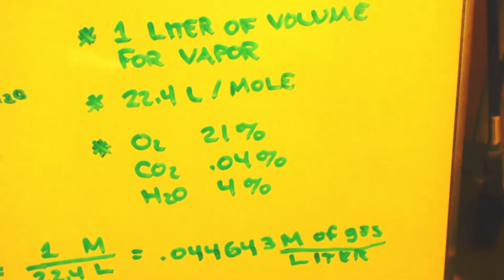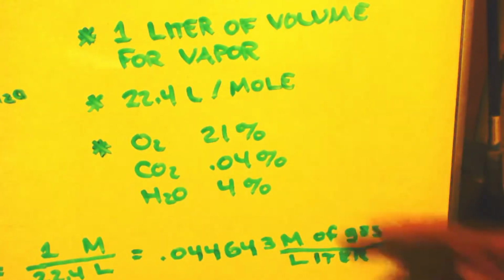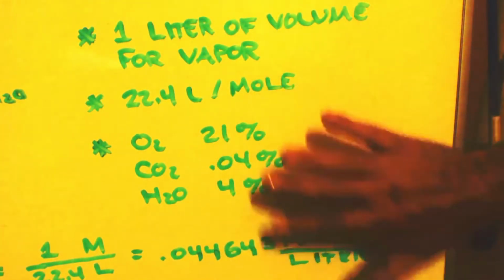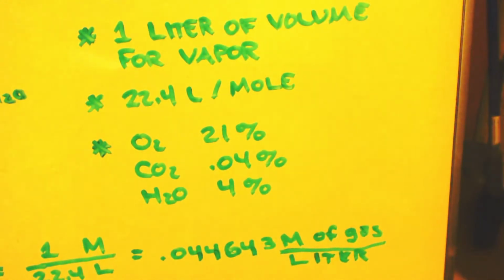If you're allowed to use the dihydrate salt, the manganese triacetate, you're putting water in there anyways. So I don't think it's the water. I think it's the carbon dioxide and the oxygen, because of the double bonds, because it has the 2 double bonds and 2 carbonyls on it. But let's just say it's the oxygen. Let's just say 20% of the atmosphere might screw up our reaction.